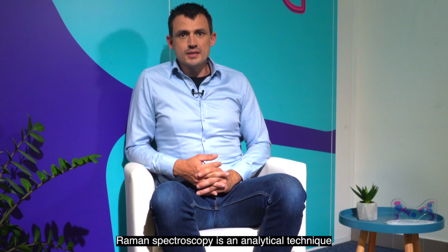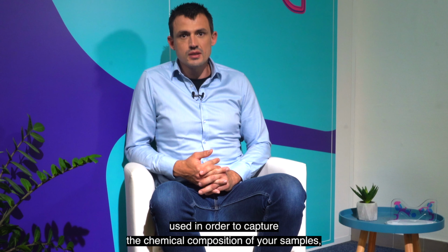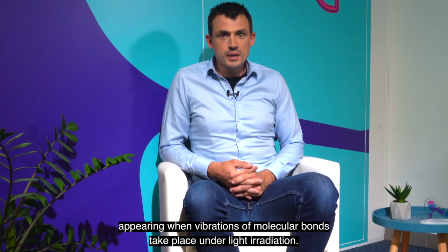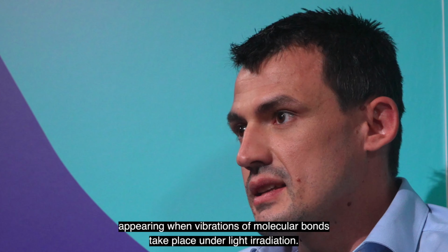Raman spectroscopy is an analytical technique that is used in order to capture the chemical compositions of your samples, medium or cell cultures. This technique is based on light-matter interactions and more specifically on the light scattering phenomenon appearing when vibrations of molecular bonds take place under light irradiation.